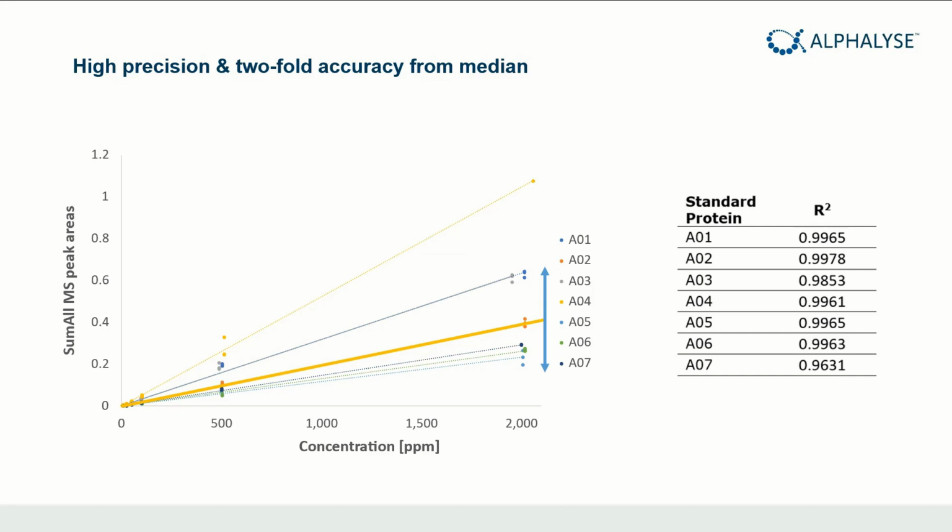So we use these standards to see if this is true for each sample and if there are any matrix effects and things not behaving as they should. And that's why we have 7 different standards to take this matrix effects and variability into account.